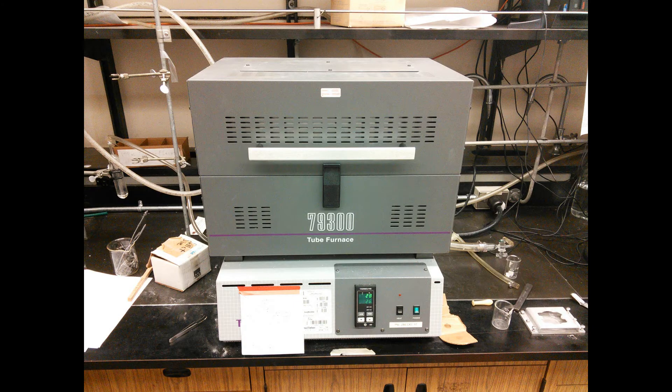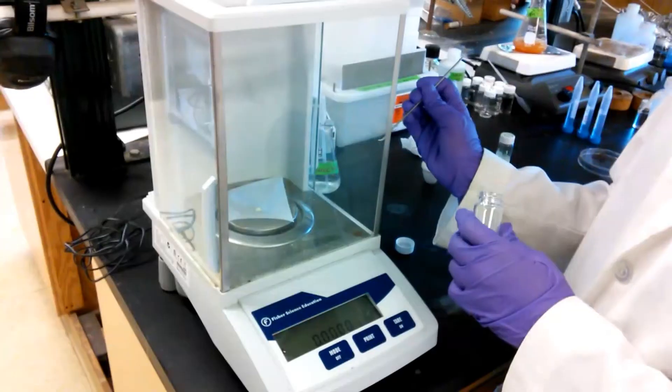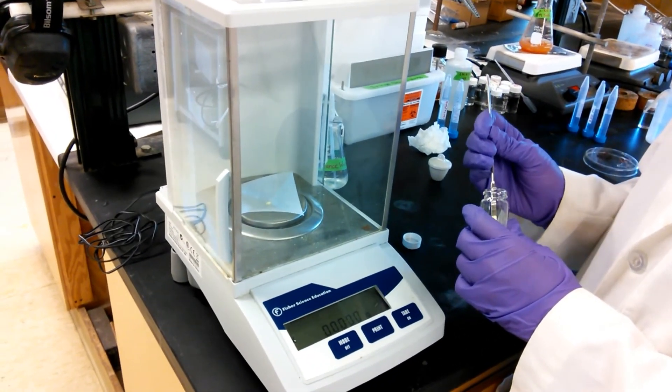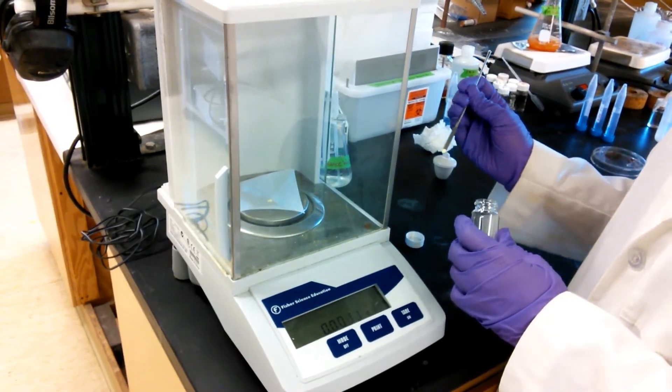Tungsten oxide powder is then placed in a tube furnace at 500 degrees Celsius for 2 hours. The necessary amount of tungsten oxide is weighed and dispersed into a sulfuric acid solution with a pH of 3.5.